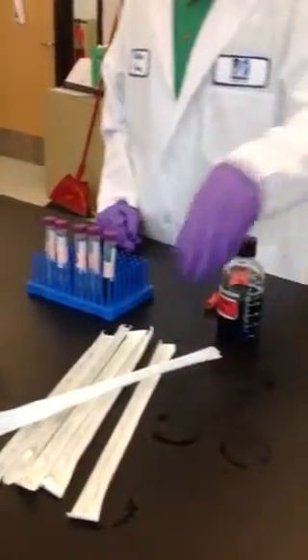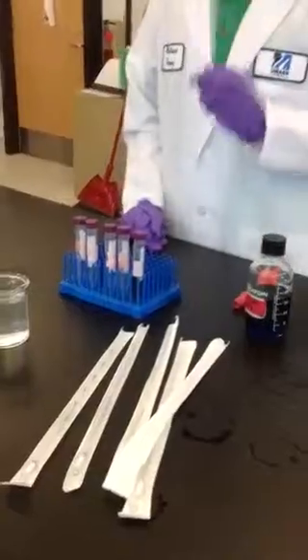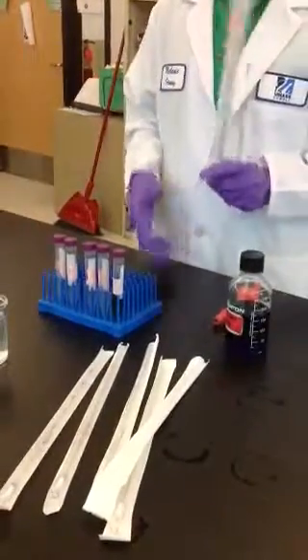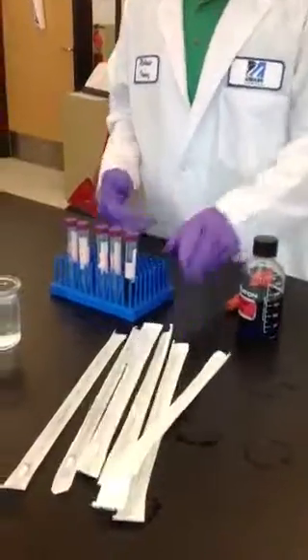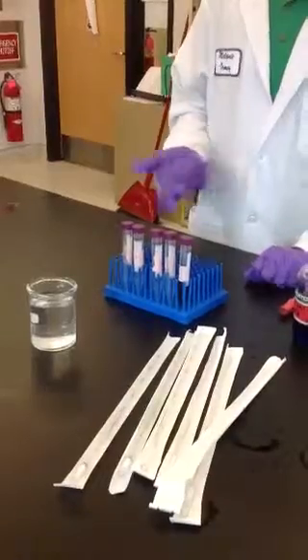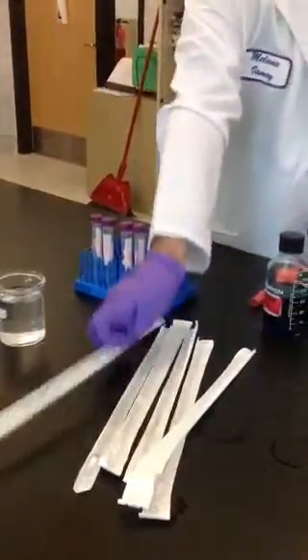The first thing you want to do is take a 10ml pipette and take 10ml and put it into the stock solution, but I did that ahead of time so we don't have to do that. The second step is you're going to want to label the tubes from 1 to 5 or 6, depending on how many tubes you have — I did that as well.